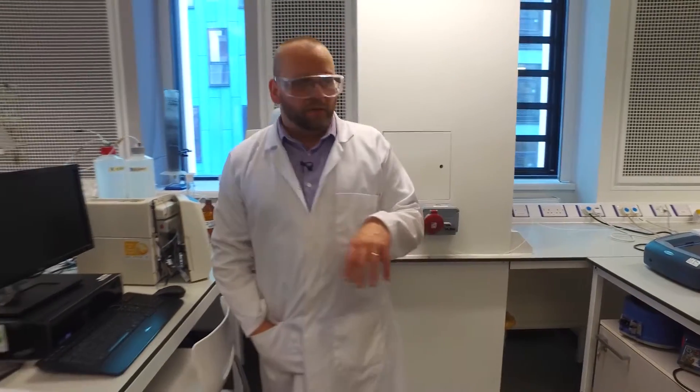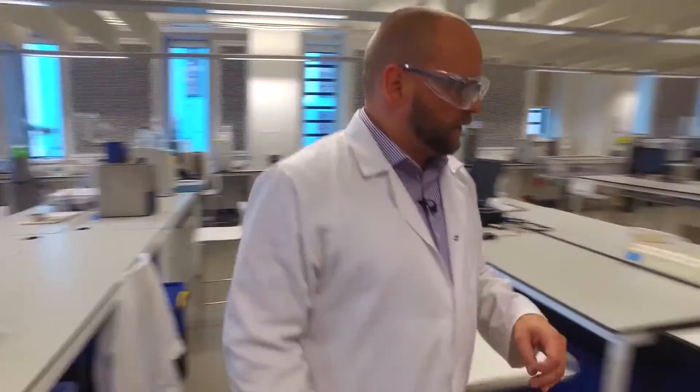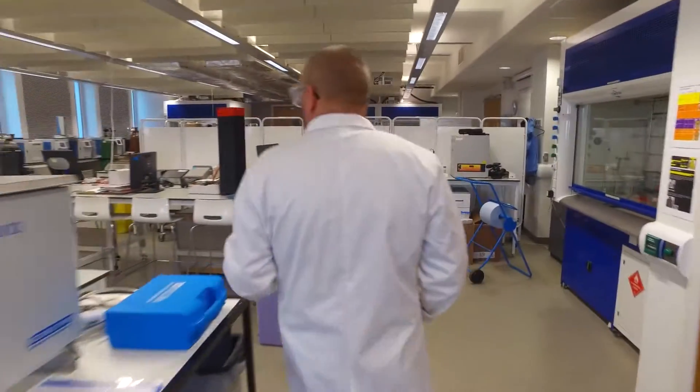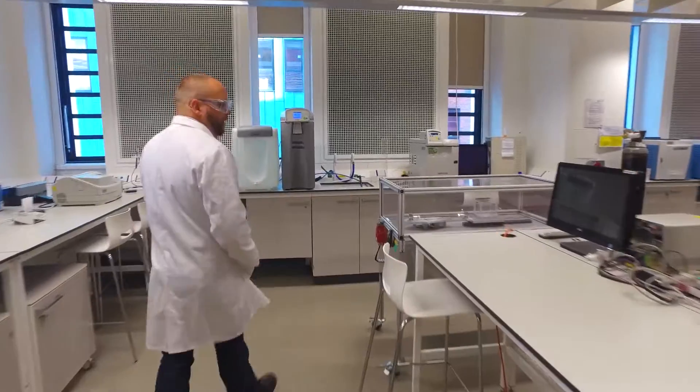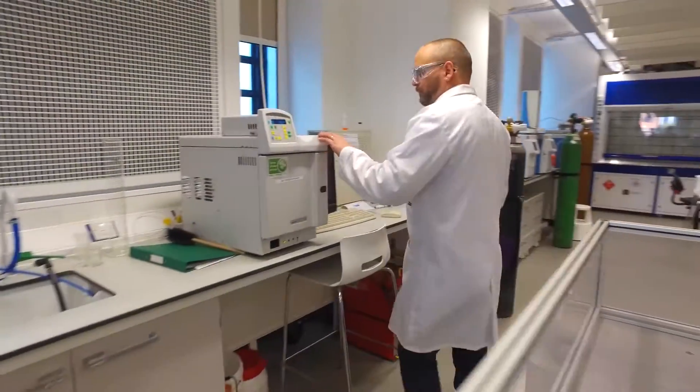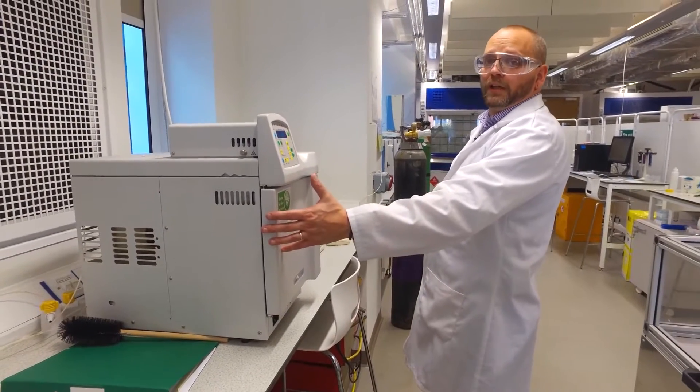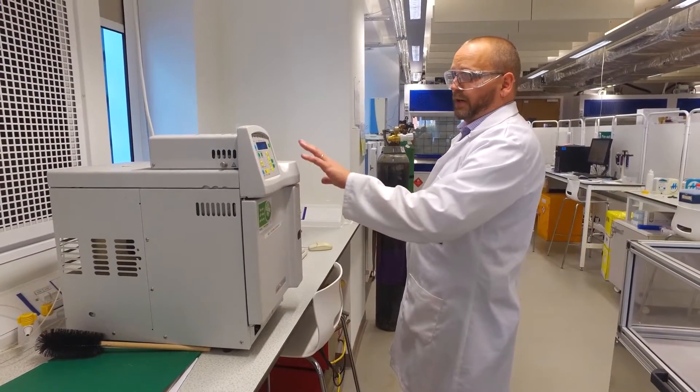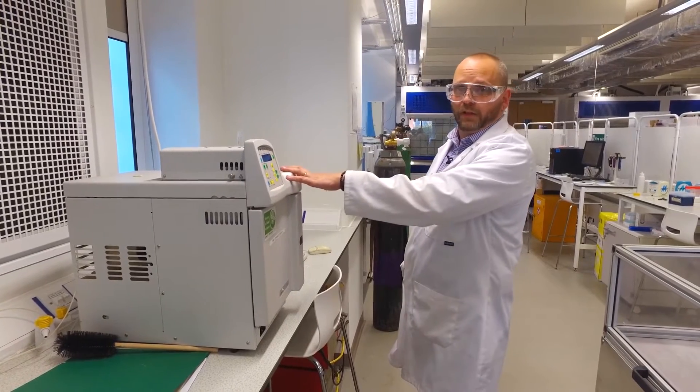Also available to students as part of that research program, over here we have some gas chromatograph systems. If you have an organic content to your effluent, you can take a sample and run it through gas chromatography and be able to fingerprint the organic content within those systems.